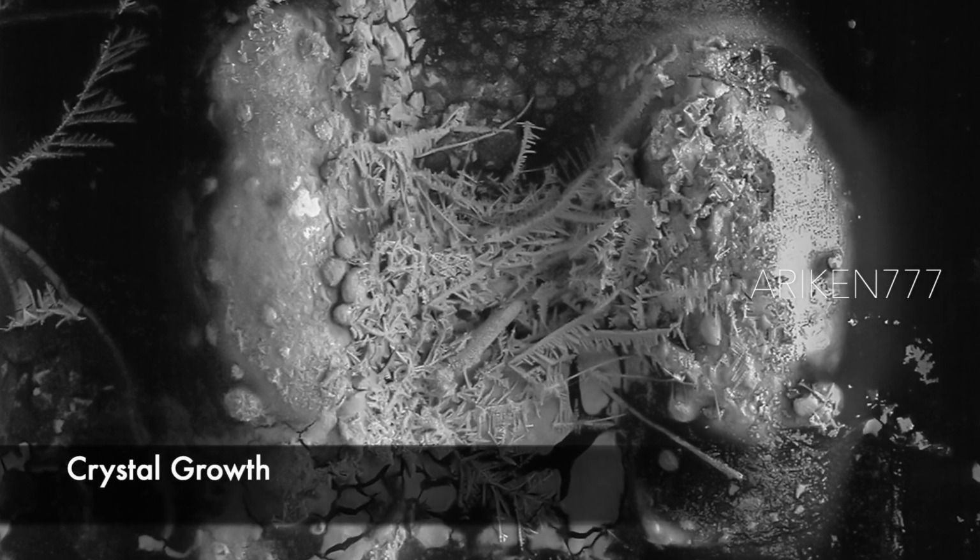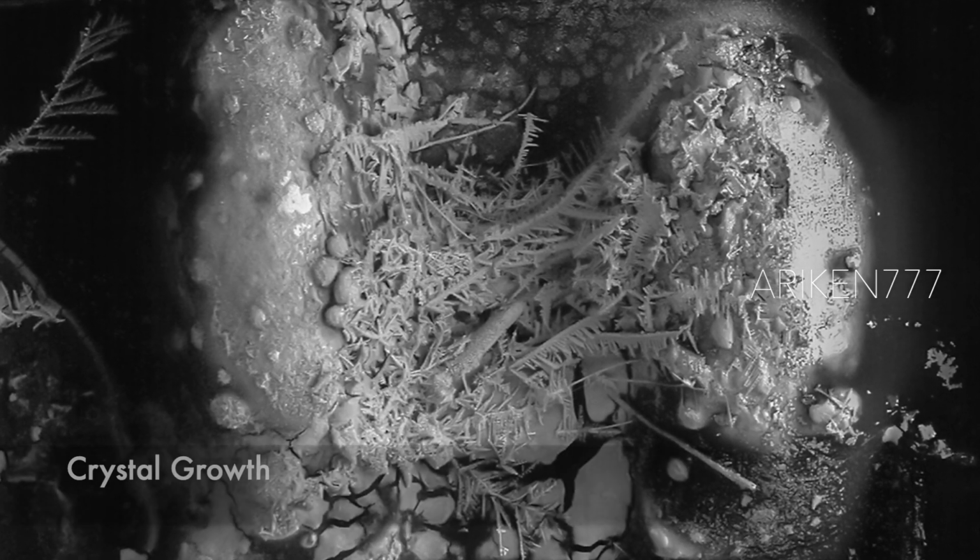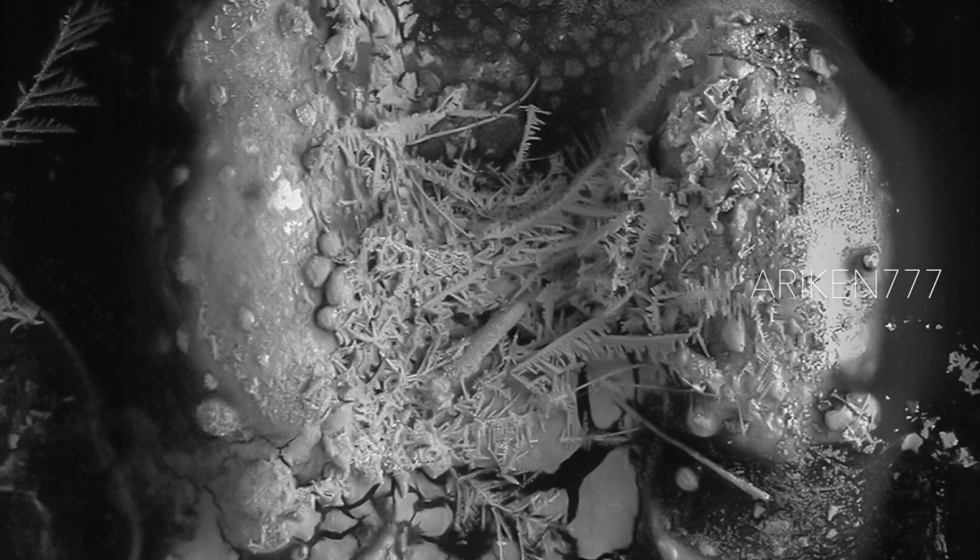Silver crystal growth between electrical solder joints causing electrical failure.